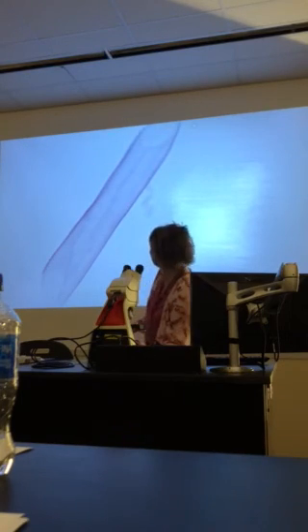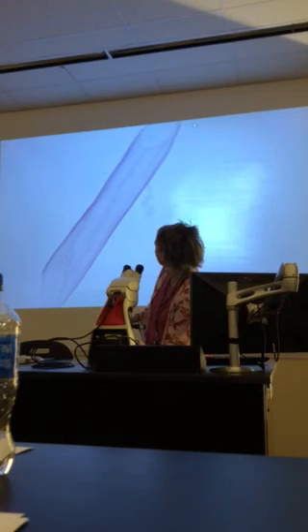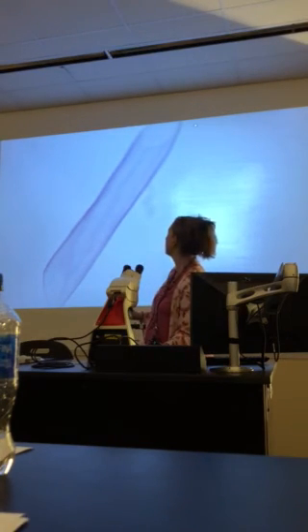That is a really good vessel cell right here. They're much bigger. This is a vessel cell right here. Okay. Much wider, and it's got a little bit more of the cross hatching to it. There are going to be tiny openings in there, but the vessel elements are much wider, okay? So much, much wider there.